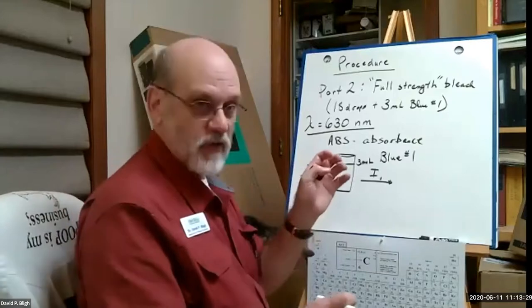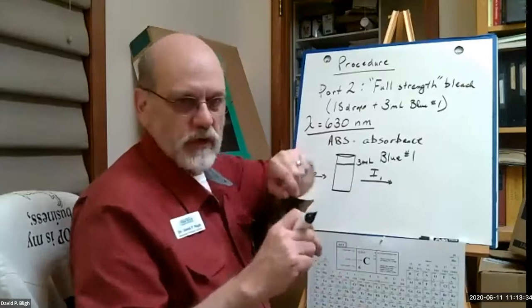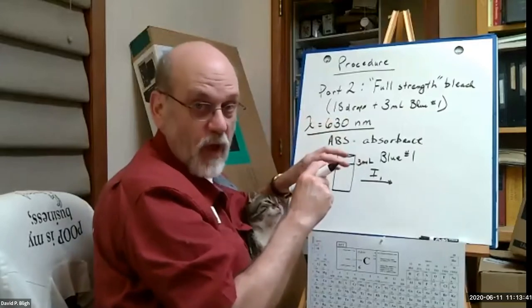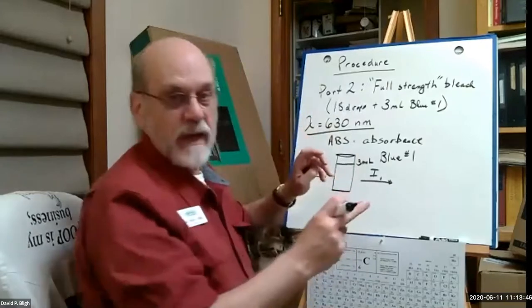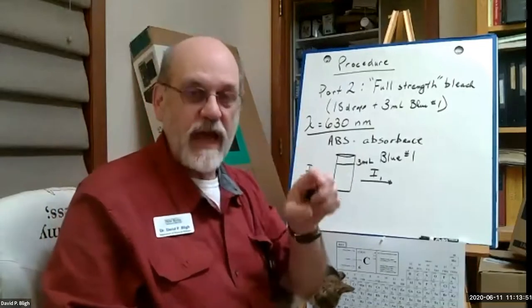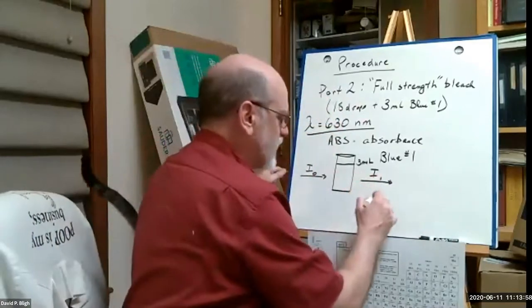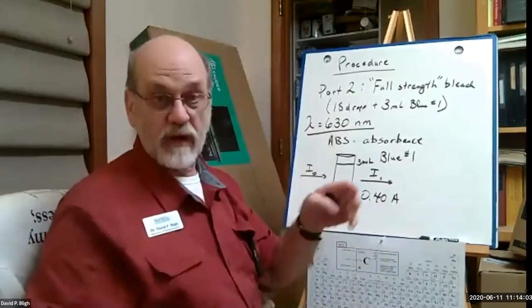But once the 18 drops are in there, you want to use maybe a little stir rod, put it in there and mix it around. Don't take too long, just mix it, and then close the lid. Start your timer immediately. As you start the timer, somebody else in your group will read the absorbance. And the absorbance might be something in the neighborhood of 0.4. I'm just spitballing here.